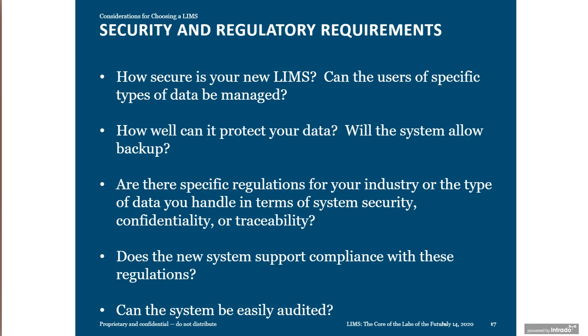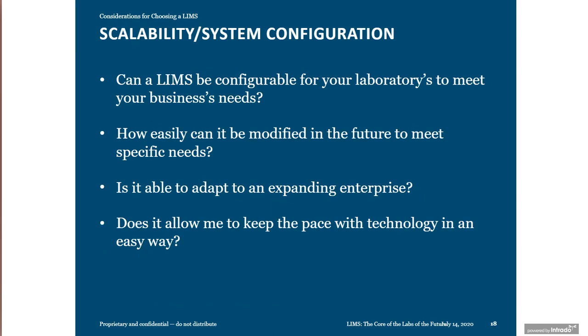How well can I protect my data with this LIMS? Will the system allow backup or even archives so I can comply with my record retention policy? Can this system be easily audited? Does the system have protection so I can ensure that I comply with my cybersecurity guidelines?